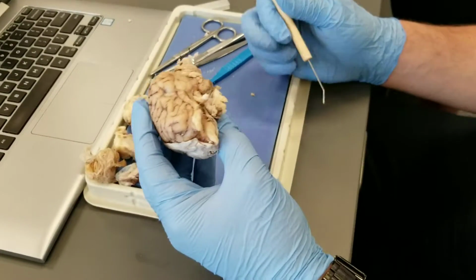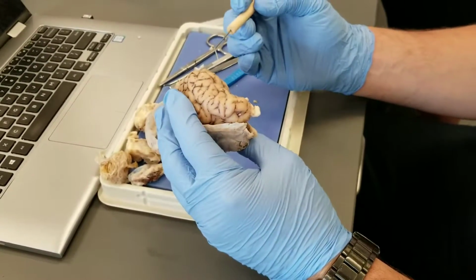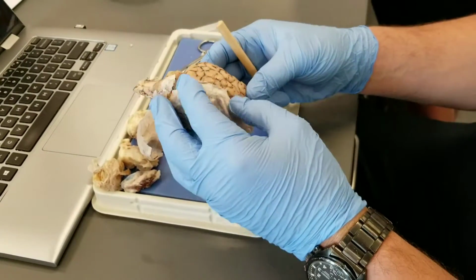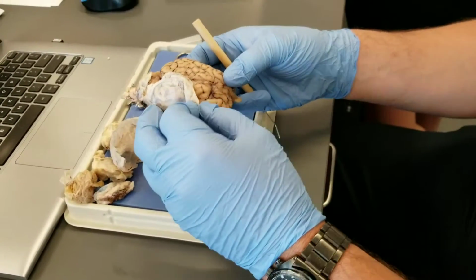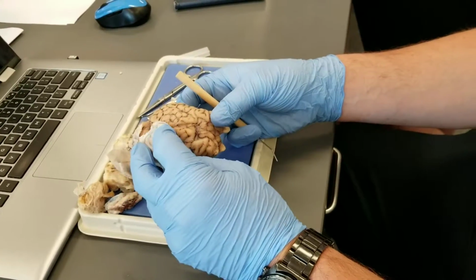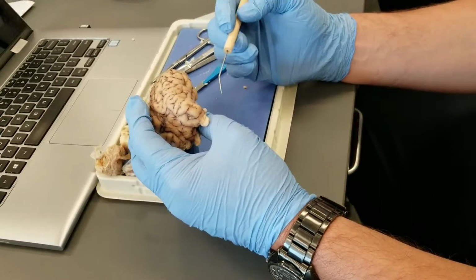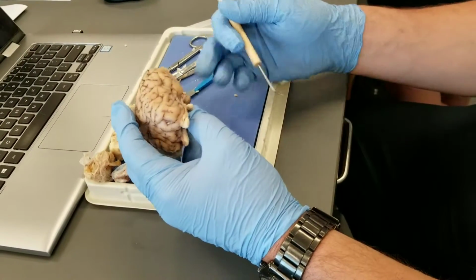That's deep inside. Then I would identify the subregion. So I'd say, all right, look, frontal lobe, temporal lobe, parietal lobe, occipital lobe. Would you ask us for like Broca's? It's not Broca's thing. Oh, Broca's aphasia. Well, I haven't talked about that. So Broca's area would be in this area here, and Wernicke's area is back here. But we'll talk about that in lecture, so we don't have to identify that.